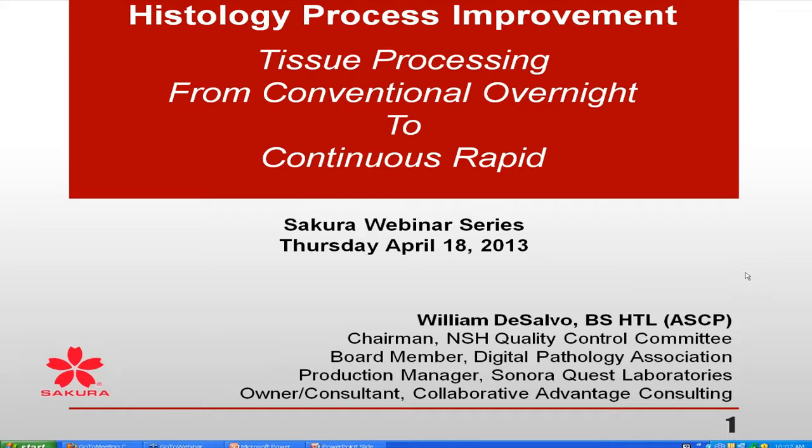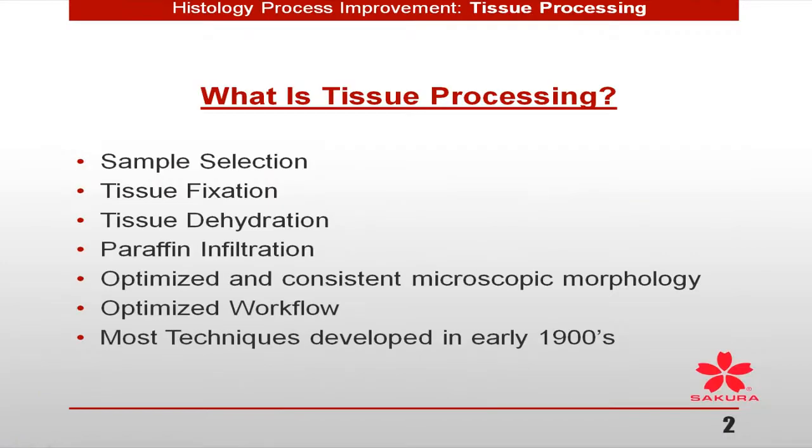So today's discussion, we'll call it a discussion, is about tissue processing, and from conventional overnight processing all the way to continuous rapid. So what are we really talking about?